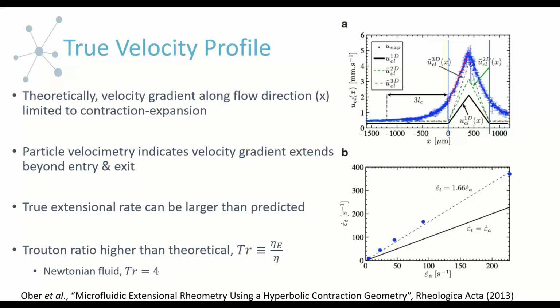And I'll point out, and we've talked about this in some of our fundamentals webinars, that when it comes to designing rheometers and viscometers, the goal is always to have as simple a flow field as possible, as well controlled and defined as possible, because the rheological properties are all calculated and you want to facilitate that calculation. One of the challenges with the extensional work is that it's a little tricky. And although we can introduce that extensional component, the simplicity of the flow field and the control is not as ideal as we would like.